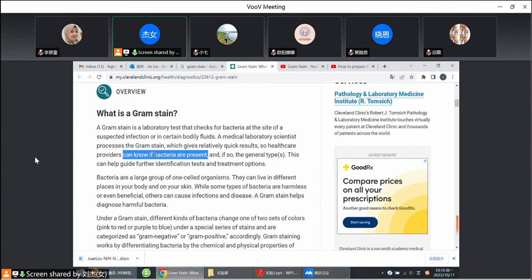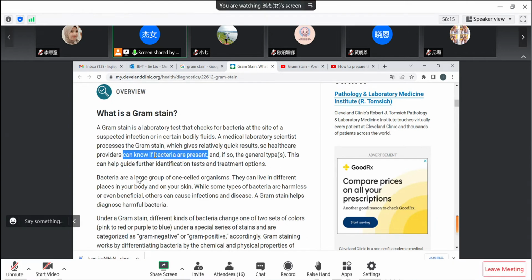They are transparent, so it's unbelievable that you can see bacteria just under the light microscope. Only when they are stained with some color can you notice them, and see the shape, morphology and structure of the bacteria.